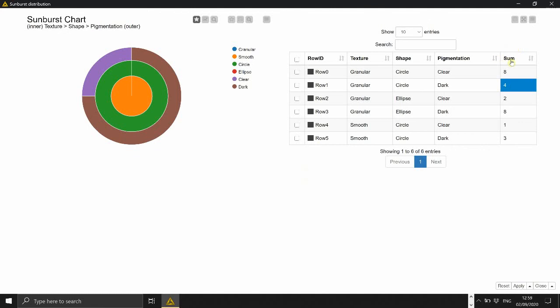The only thing is that in your original table there shouldn't be a column called sum because it's a column I'm creating for the plot so if you have a column already called sum in your table there will conflict and you might have the wrong information displayed there.